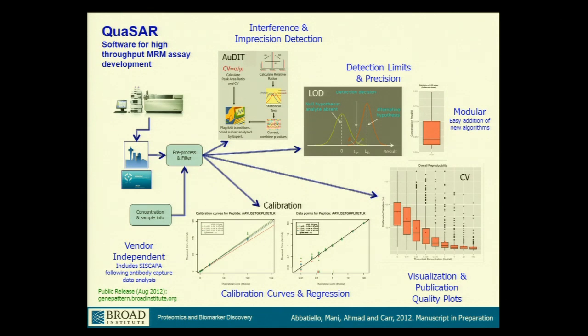You would process it using some tool, either vendor provided or third-party tools. One is called Skyline, which I think Sue might talk about, that lets you process MRM-MS data. Basically, what you will be doing here is you will process the raw data files, and you will do peak extraction and what is called peak integration. I think Hasmik mentioned peak area ratios yesterday.